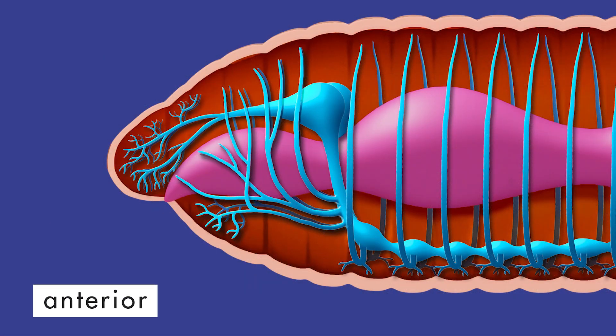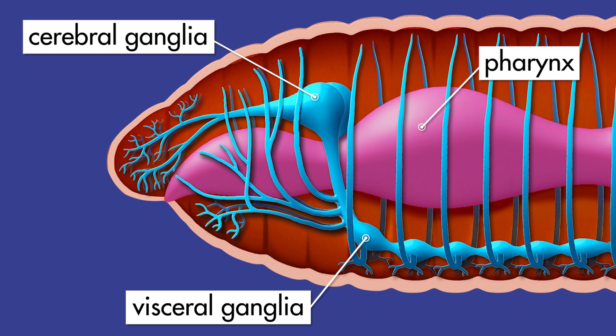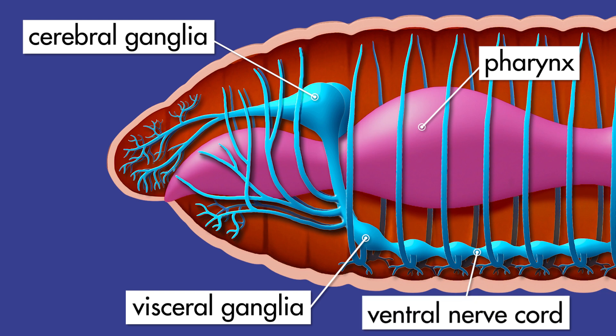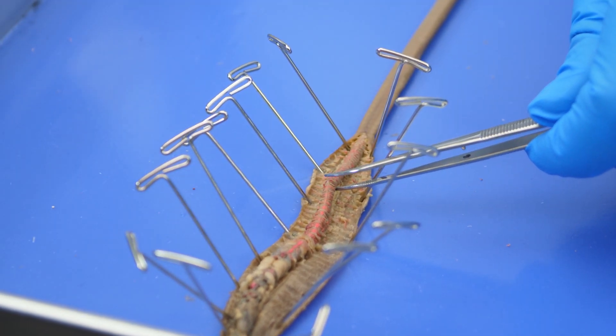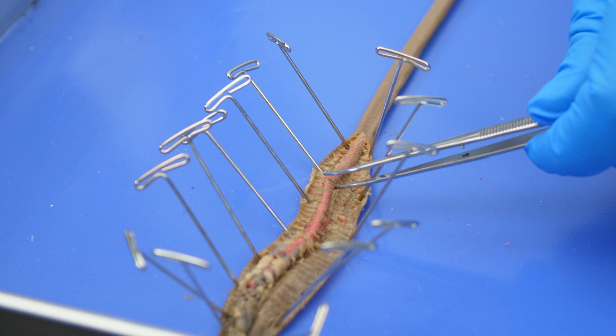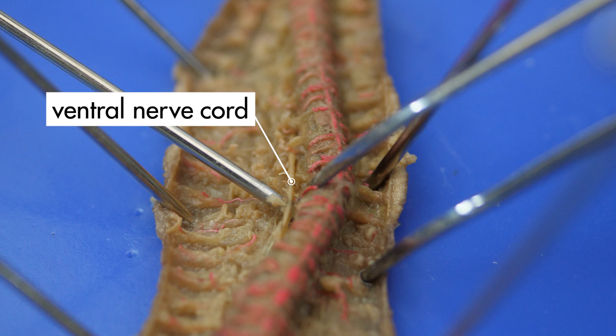A worm does not have a complex nervous system, but it does have several sets of ganglia that carry on some of the functions of a brain. Beneath the pharynx and slightly behind the cerebral ganglia are the visceral ganglia. The main nerve that carries impulses to and from the visceral ganglia is the ventral nerve cord. To see the ventral nerve cord, we need to lift up the intestine with the forceps and cut it free from the septa with the scalpel. This white line of tissue is the ventral nerve cord — it runs the length of the worm from the visceral ganglia to the posterior end.